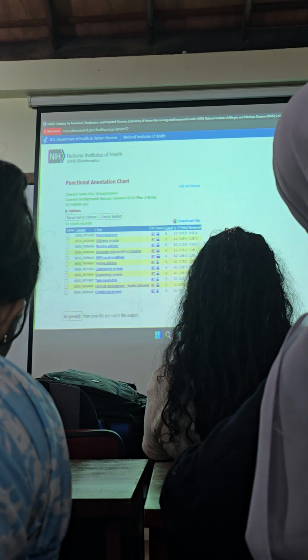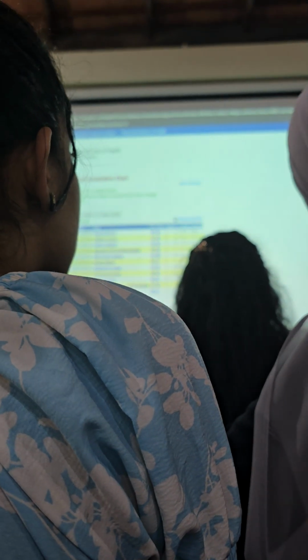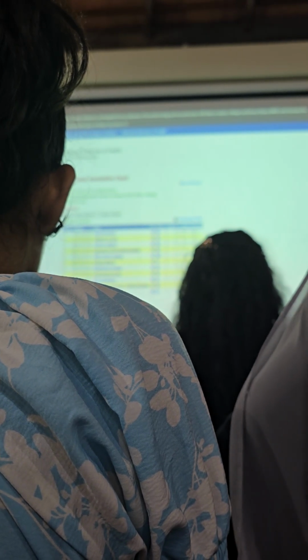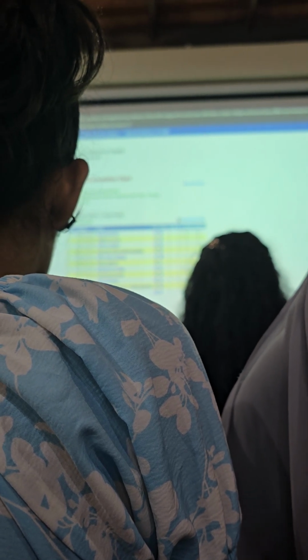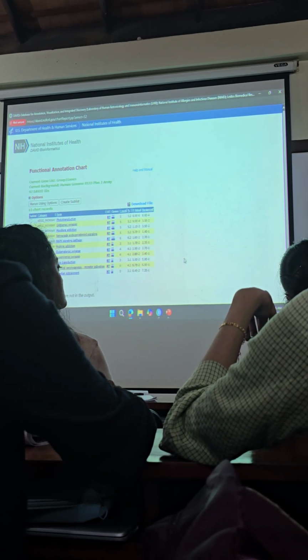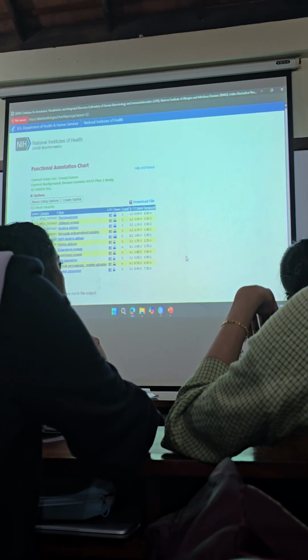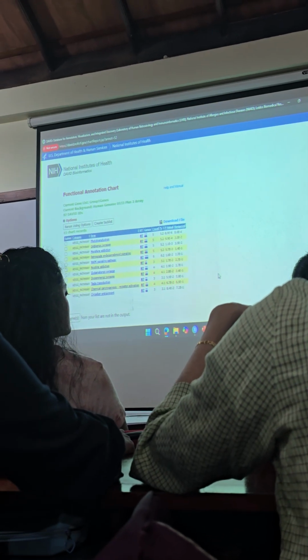Pathways. So using those pathways you assign the name to that particular group. Okay? So there you have to look at the literature as well. So you already know there are 4 groups from the literature. You assign the group name according to what you find in the literature. Right? So if the group has a low probability score for this pathway, you assign that name to that particular group. Right? So the other groups are 3 and 4.